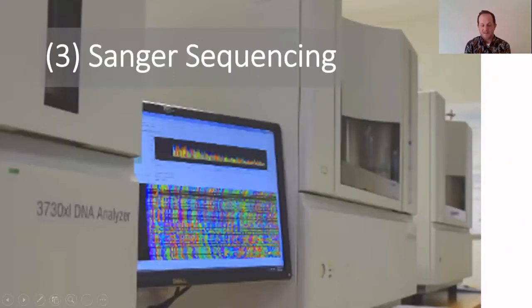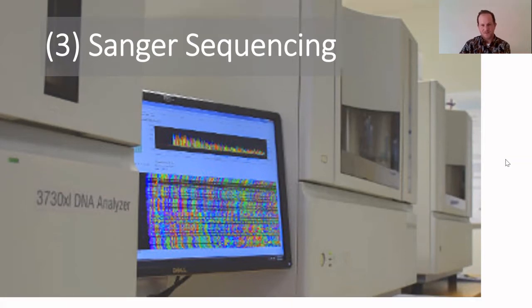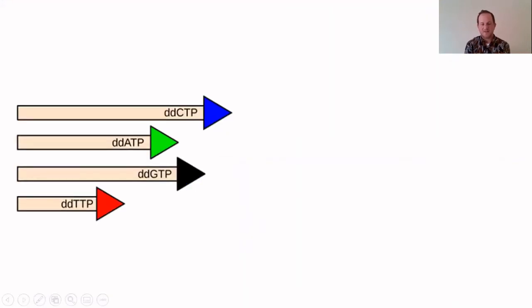The next step is DNA sequencing, where our target DNA is read. We generally use Sanger sequencing for the DNA barcoding that we're doing at the museum. In Sanger sequencing, the PCR copies are terminated at different lengths with fluorescent nucleotides. This results in every base pair in the target sequence being tagged with a color corresponding to which particular nucleotide base, A, C, G, or T, is at that position in the sequence.